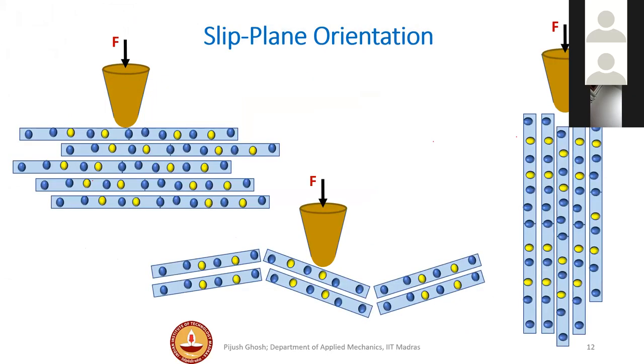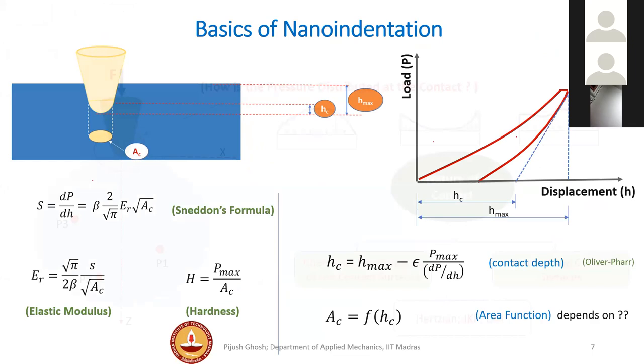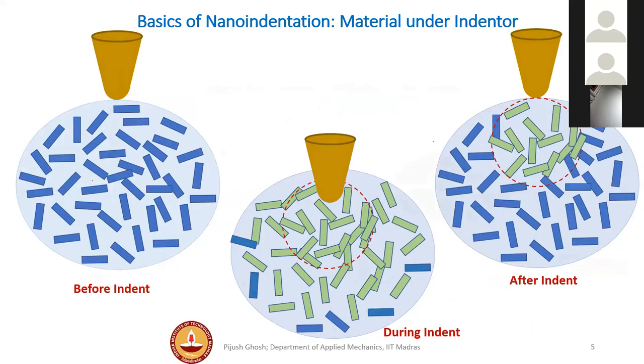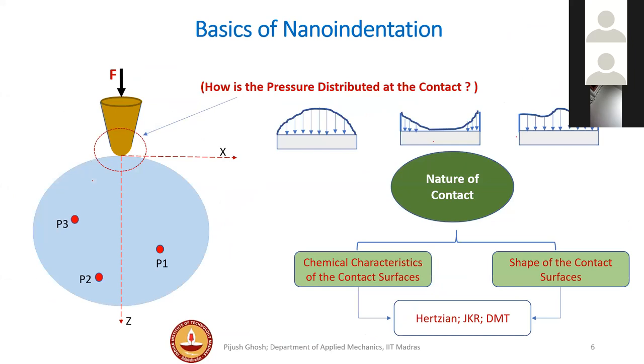Now let me come to your first question, just to give you an idea why it is so important to have the right surface. If you remember, I used this slide, and that's the reason why I indirectly explained this. When you have a very rough surface, your indenter is sitting on the rough surface with the projections, and the distribution of the stress is going to be very different than when it is sitting on a smooth surface. All your analysis, calculations and derivations are based on the fact that the surface is smooth and the pressure distribution is such. But when you have a rough surface, particularly with no idea about how these surface projections are, you will have some erroneous results. So it is good that the surface is as smooth as possible.